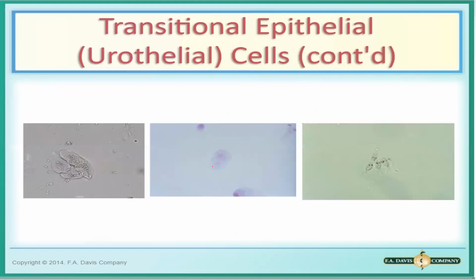So this is how your transitional epithelial cell looks. Centrally located yung kanyang nucleus, and yung kanyang cytoplasm is much more rounder, or consistent kaysa kay squamous epithelial cell na parang mas random and mas malapad yung cytoplasm.